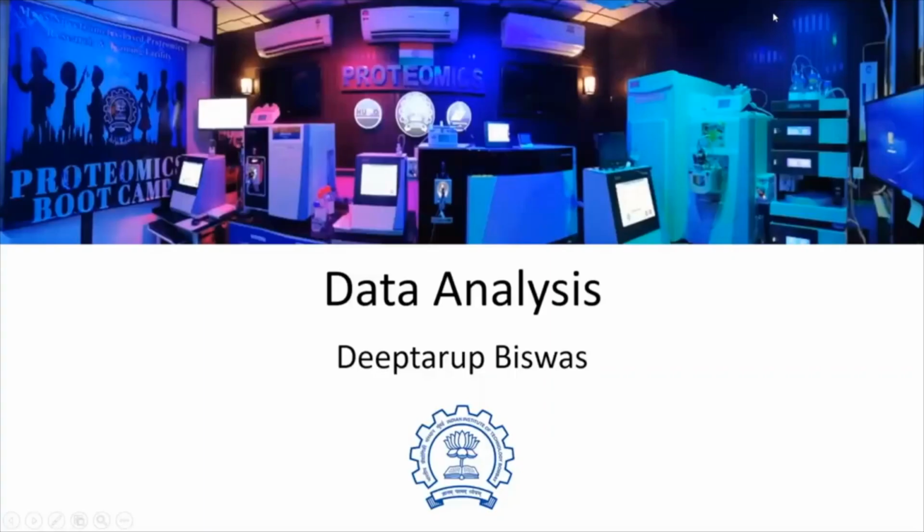In this session, we have mostly talked about the MaxQuant data analysis, right? That you have got some raw files, or you have generated some raw files, and you want to know what are the proteins that got identified in those particular files, right? So in that case, as I have discussed, you need the UniProt database file.